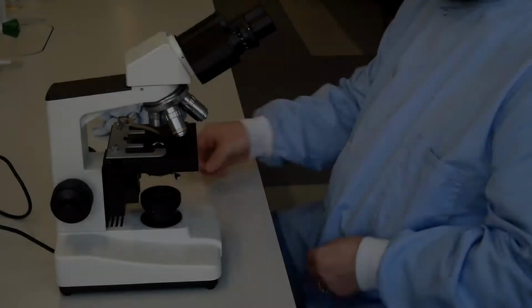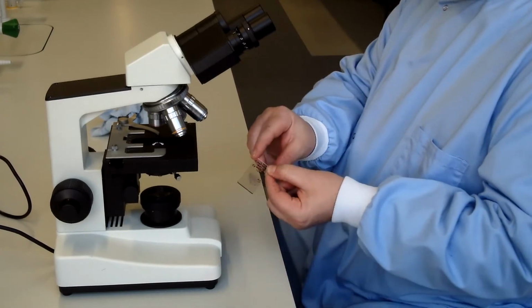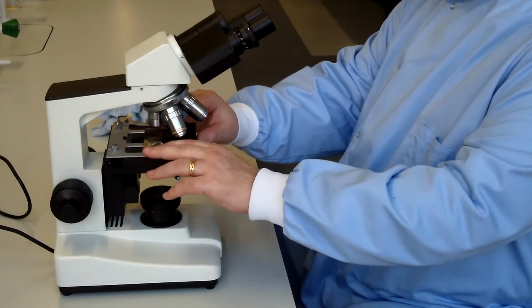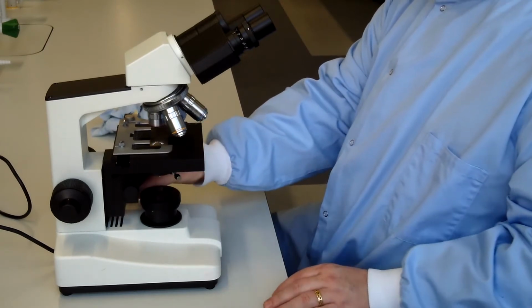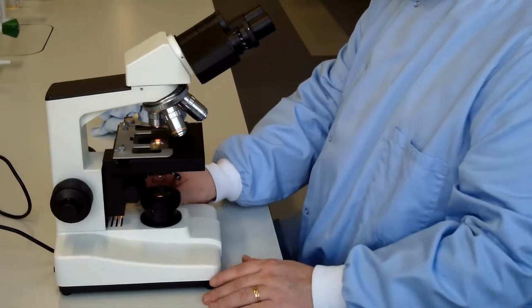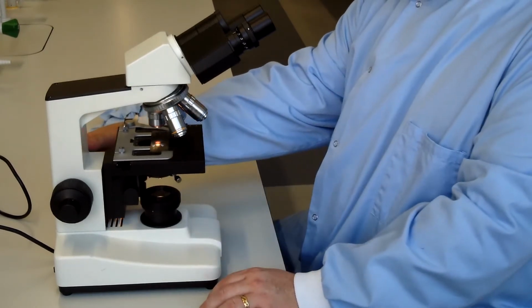In this video we're going to look at how to use the microscope to look at our gram stain slide. So we have a slide of gram stain bacteria and we place it into the holder on the microscope stage. And in this position we can move it backwards and forwards, left and right, so that we can find an interesting area with bacteria on to look at. We switch on the power of the microscope and adjust the light settings if necessary.